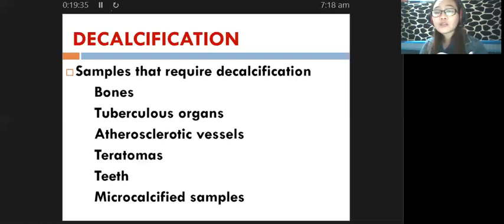And so your tissue sample will still be exposed to the acid. So after performing decalcification, if the process is already complete, you have to ensure that your tissue sample is washed properly and completely, so that there is no prolonged exposure of your tissue components to the acid. So, in particular, what are the effects of decalcification on staining? In staining, what will be greatly affected is the action of your basic dyes.